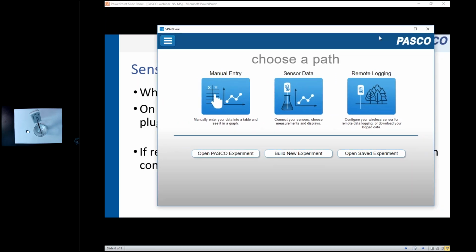When you do a firmware update, some sensors, like the temperature sensor, do not have a USB plug on them at all. It's battery only. So your only choice is to do the update through Bluetooth. But if you have a sensor like the voltage sensor that has a USB port, it's rechargeable, I recommend doing the update with the USB plugged in, and the dongle if it's a Chromebook, because this works much faster. It's faster to transmit data through wires than it is through the air on firmware updates.